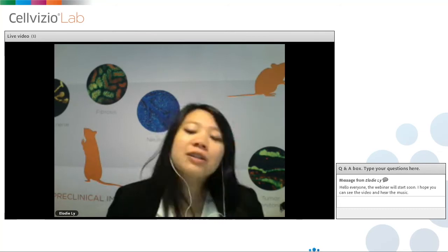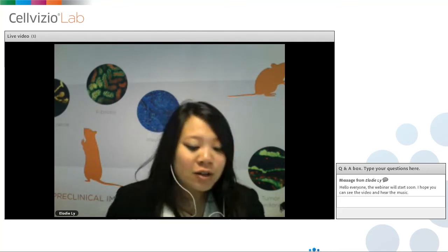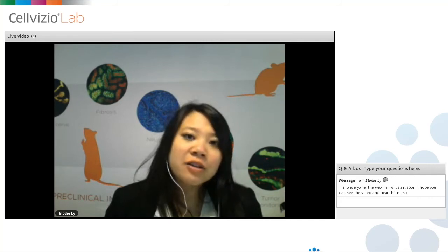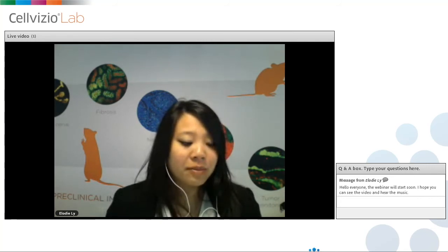I have another question regarding blood flow. Okay, can we measure blood flow using Cellvizio? So we are not able to measure the blood flow in real time.